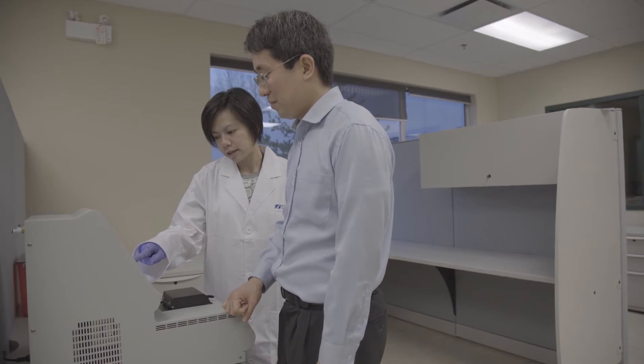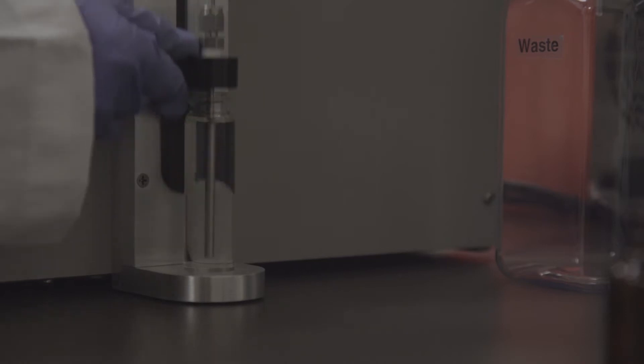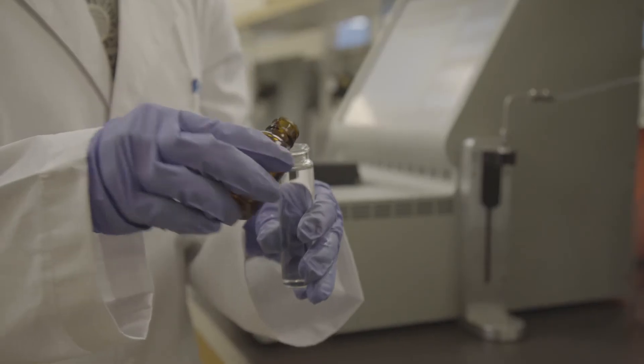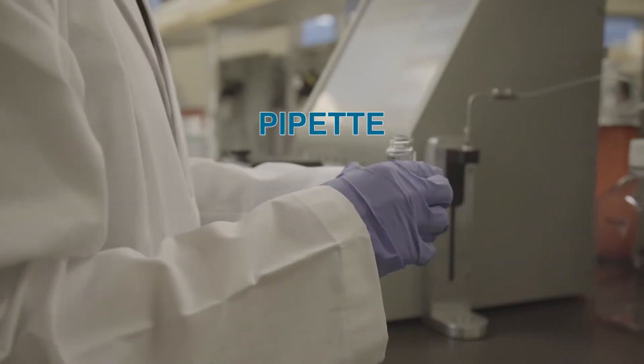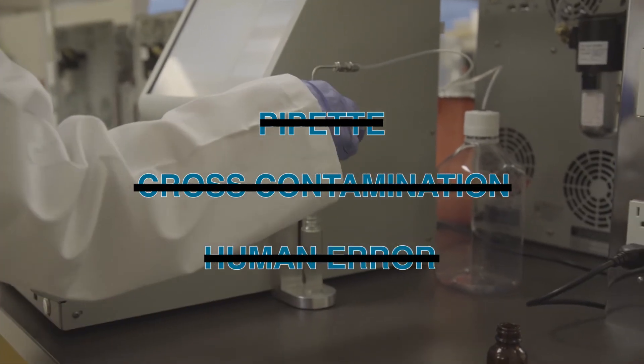The JFA 70XI features an automatic sample input using a new vial injection system that loads the sample automatically. The sample input always uses the exact amount of sample required by the ASTM method. No more pipette, no more cross-contamination, no more human errors.